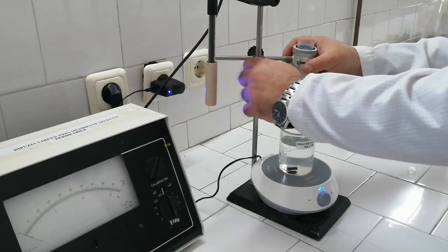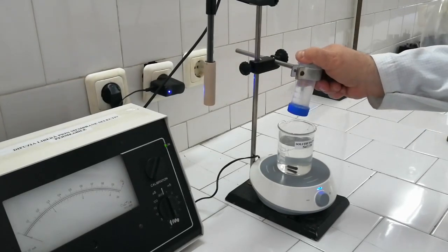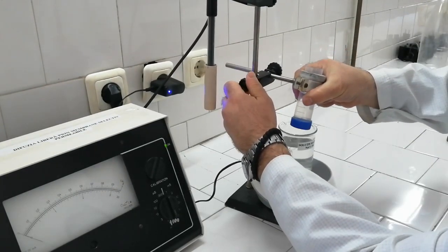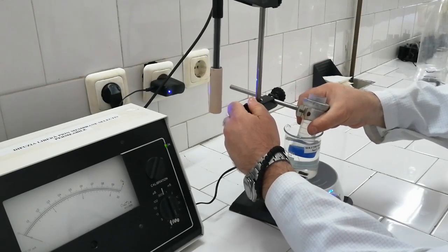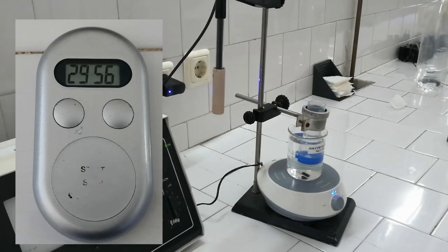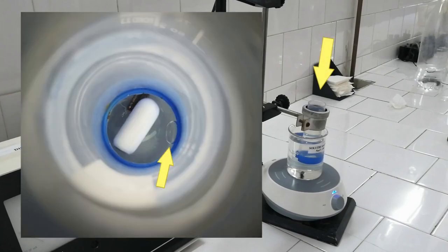Dip the internal container inside the saline solution. Tilt the internal container in order to avoid formation of air bubbles under the selectively permeable membrane. Start the chronometer as soon as the membrane touches the saline solution. Attention! After putting the two solutions in contact, by looking from the above, check if there are some air bubbles still trapped beneath the membrane. If you find air bubbles, remove them by gently shaking the internal container.